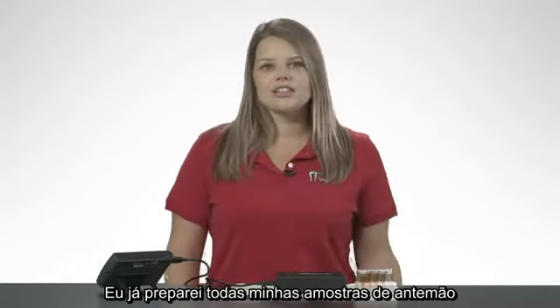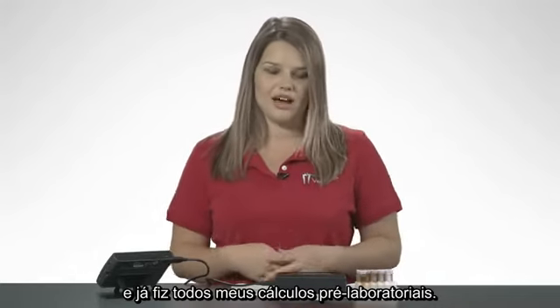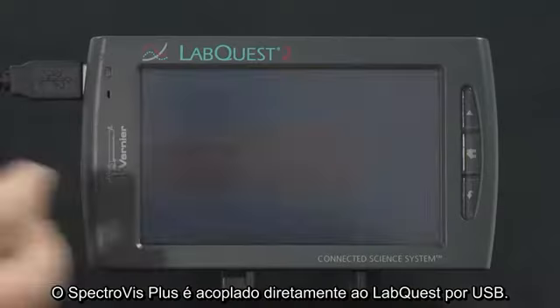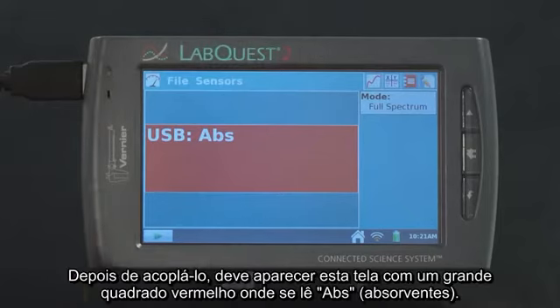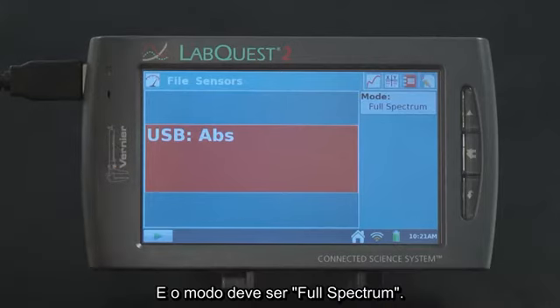Prior to this, I prepared all of my samples and did all my pre-lab calculations, so I'm actually ready to take data. The Spectravis Plus plugs in directly to the LabQuest 2 via USB. Once I've plugged it in, I should see this screen with a nice big red box that says absorbance, and the mode should be full spectrum.